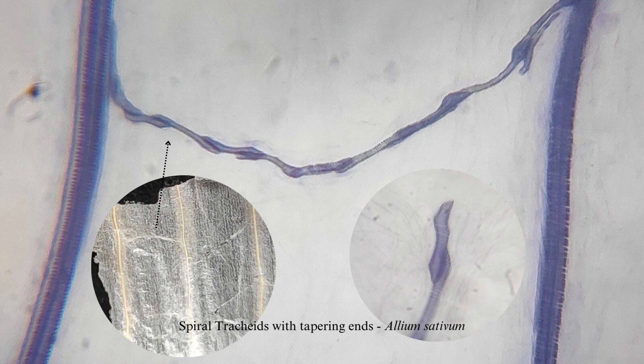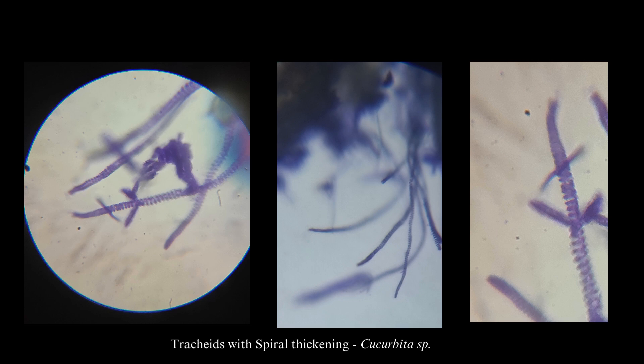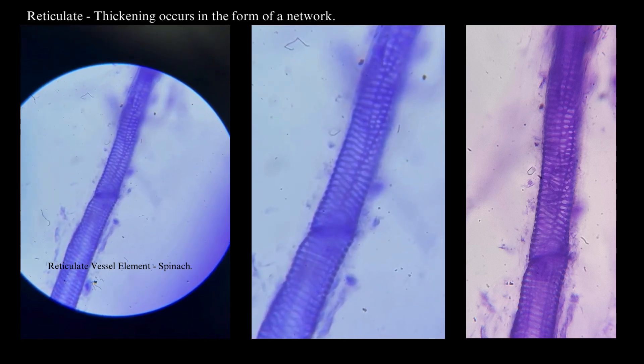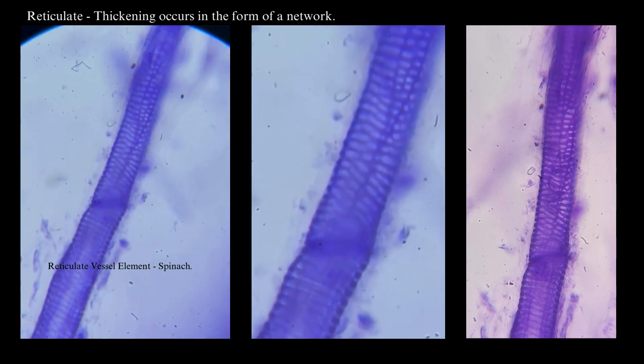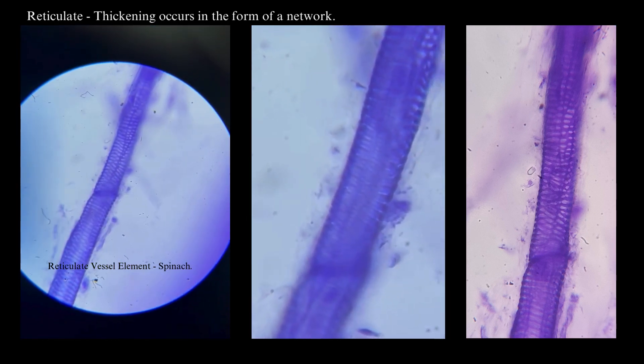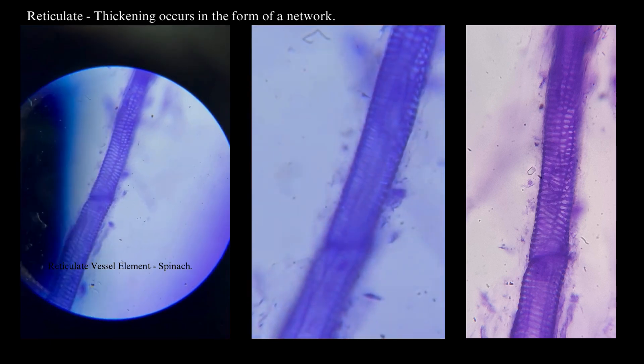This is the garlic outer peel macerated material which has been stained. You can observe the tracheary element, how it is connected with each other; you can also observe the tapering end and the spiral thickening. This is the vessel element of garlic flower stalk macerated material. Here you can observe the thickenings which occur in the form of a network — this is called reticulate thickening.